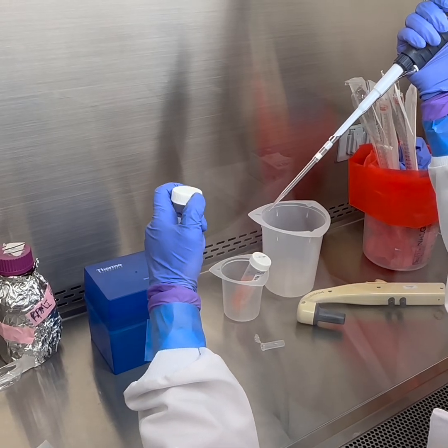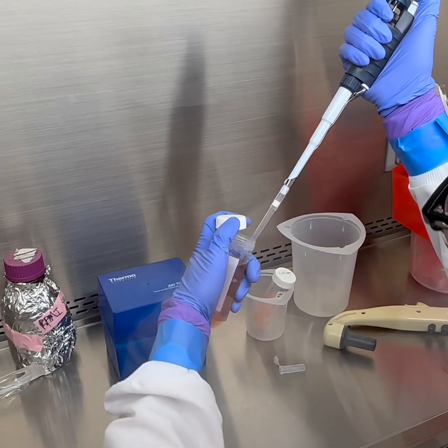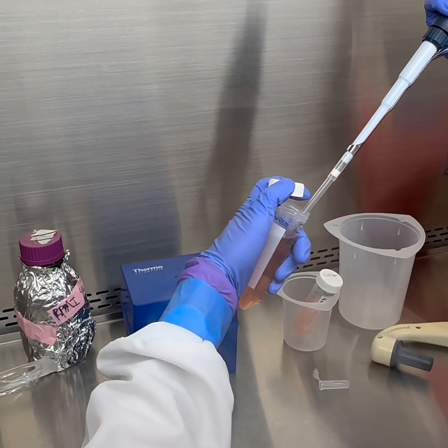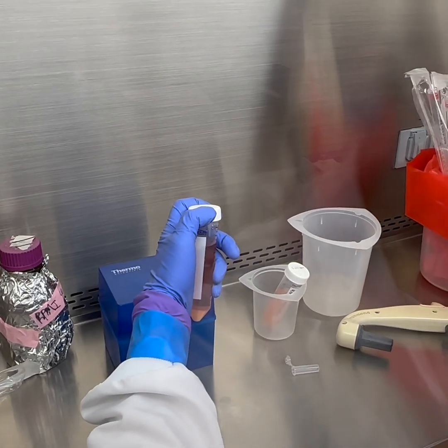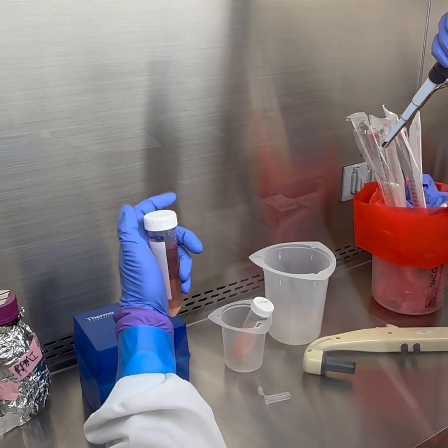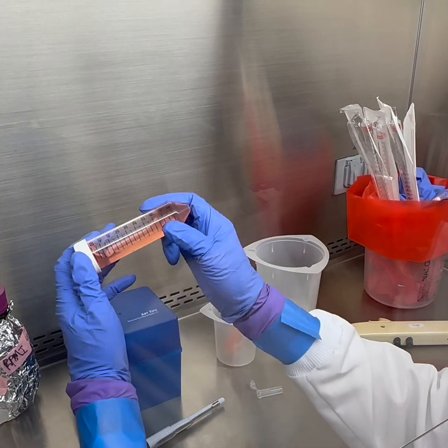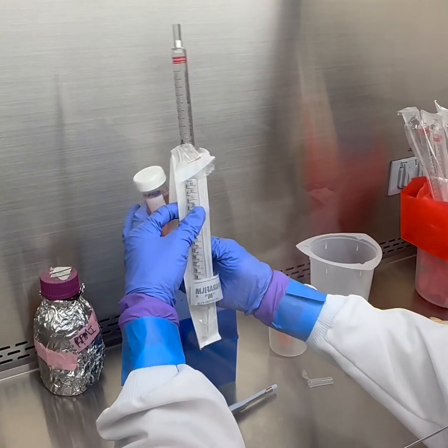Alright, I'm putting it in here. I'm going to wash a couple times. You can see it mix. I don't know if you saw that, but you could see it go into solution. Get rid of our tip. Close this up. And actually, I'll just do it this way too, but with auris, you'll probably want to use a serological to mix.